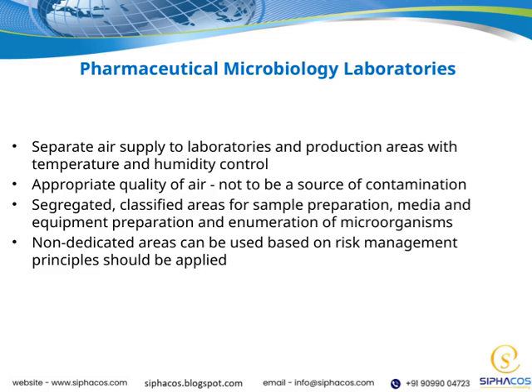Within these labs, we need segregated and classified areas for specific tasks like sample preparation, media and equipment preparation, and the enumeration of microorganisms. By clearly defining these zones, we reduce cross-contamination risks and improve process control.